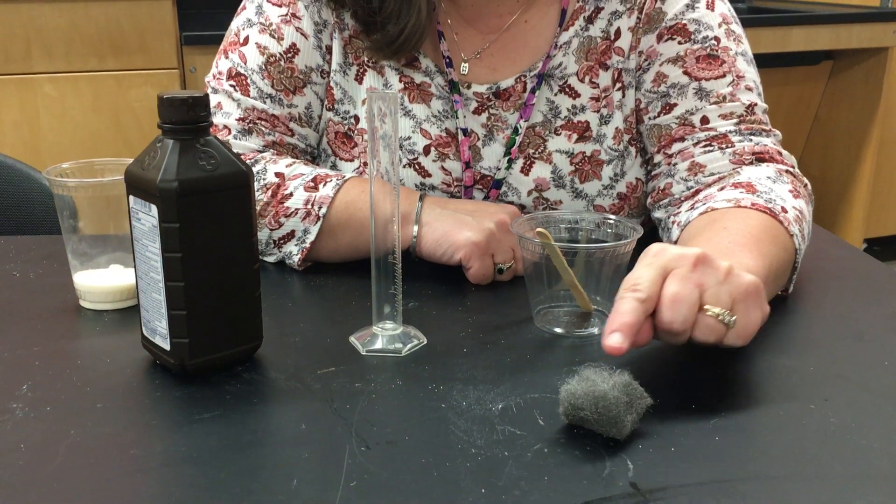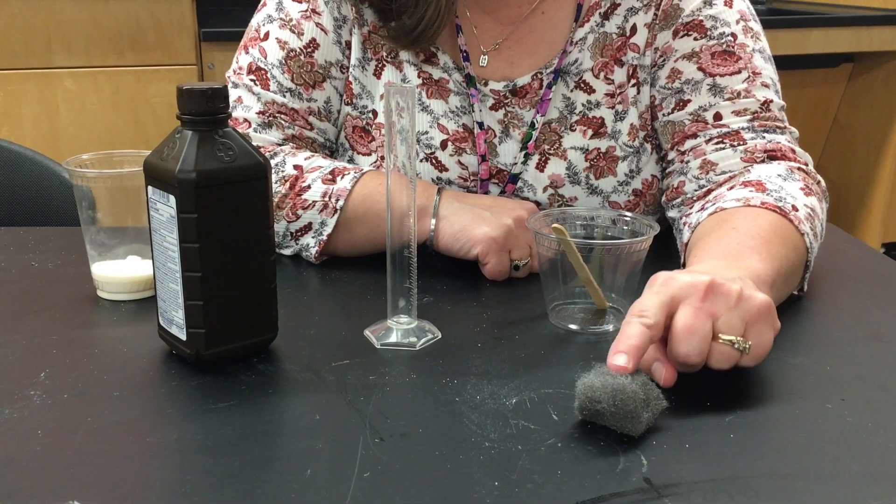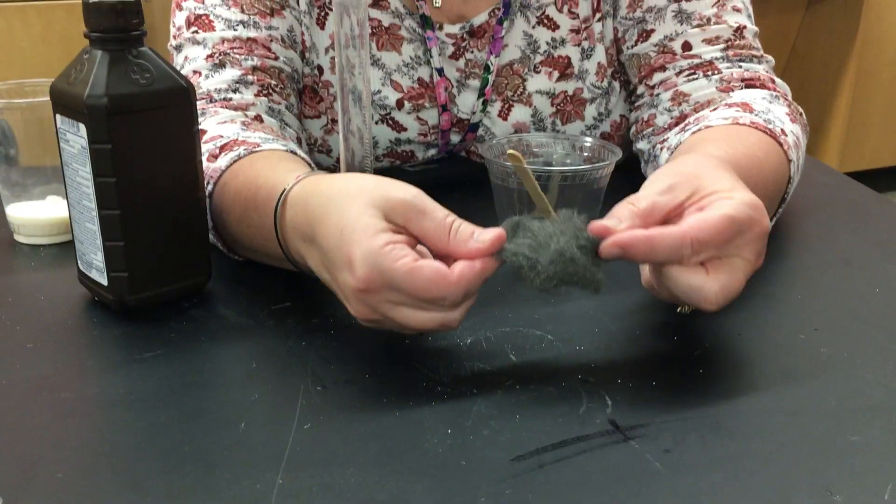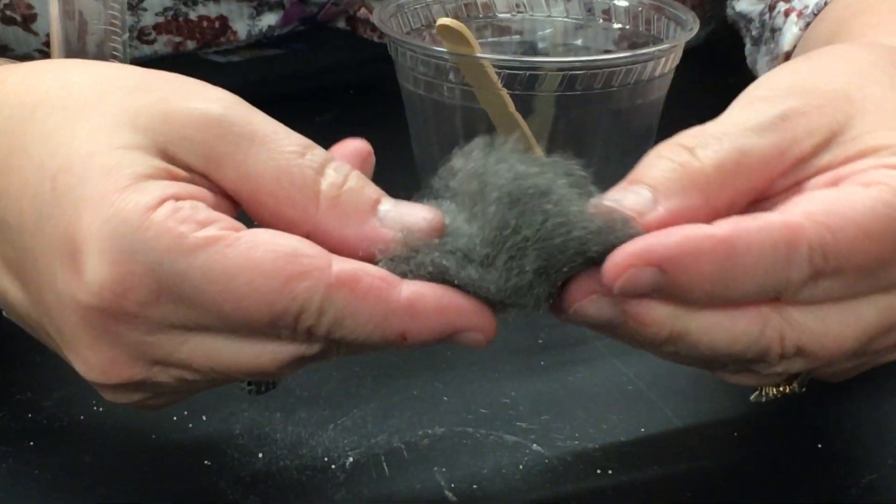First thing I want you to do is make an observation about the steel wool. This is a steel wool. It is made out of metal. It's like little metal hairs. It's kind of rough.